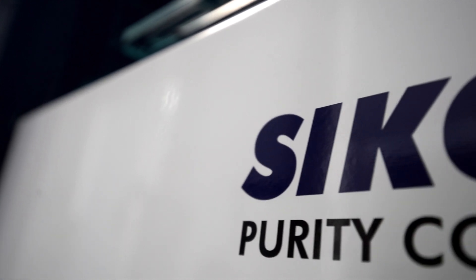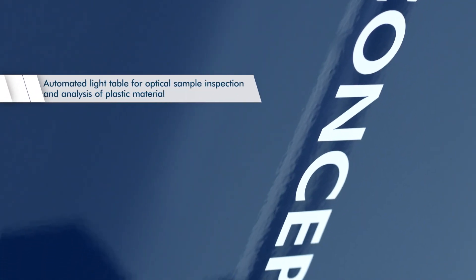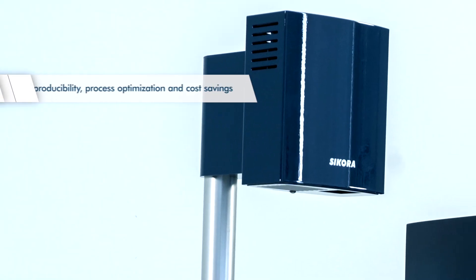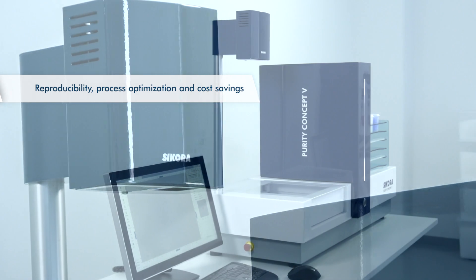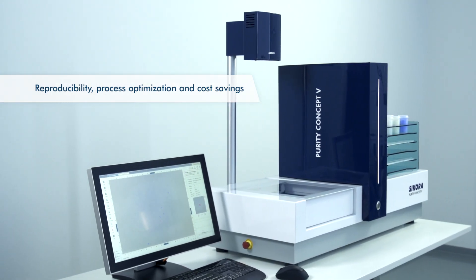The Purity Concept V — the automated light table for optical sample inspection and analysis of plastic material. The automated inspection is more precise, repeatable and reliable than a manual inspection on a light table, and contributes significantly to process optimisation as well as cost savings.